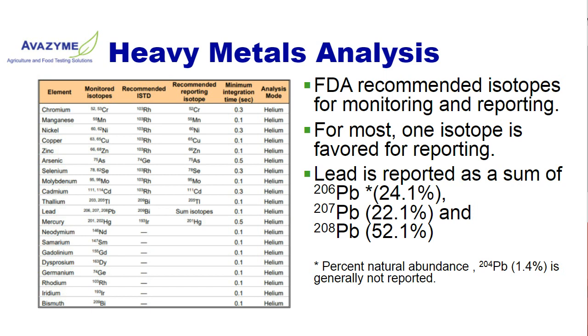This is not a heavily regulated area for FDA, and even for the states, the monitoring levels and acceptable levels of heavy metals vary from state to state. For instance, with hemp, that's just now coming together, and so the need to test these for varying regulatory environments is important.